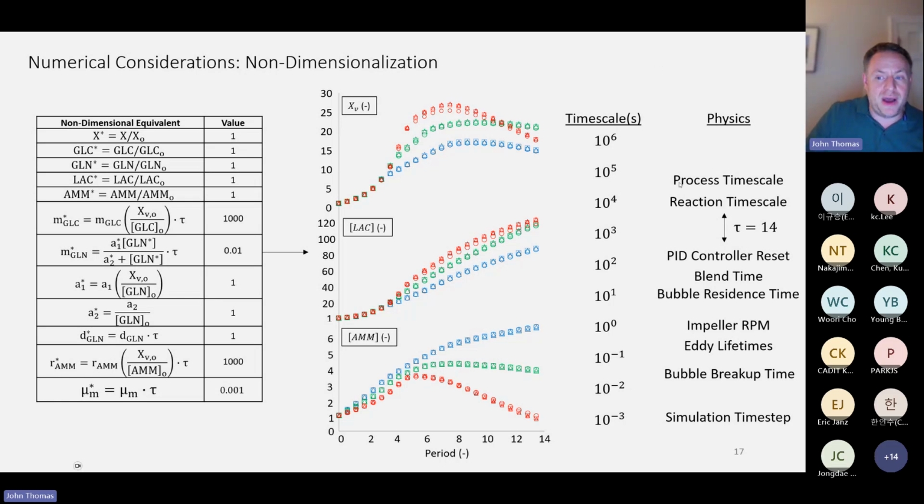So I'll be demonstrating how this is valid, and I'll be using this throughout our results in an effort to make these simulations a bit more efficient. That is, simulate a few days as opposed to 14. Importantly, we can do the full 14, that's not the problem, but if we can get the same insights over a 3-day process that's accelerated in the simulation, that saves our simulation run times by a factor of 4, which is something I'd like to do.